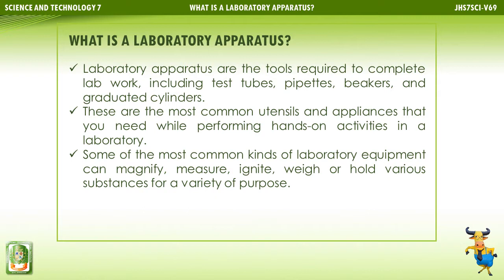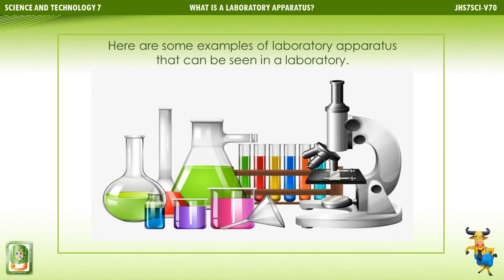Some of the most common kinds of laboratory equipment can magnify, measure, ignite, weigh or hold various substances for a variety of purposes. Here are some examples of laboratory apparatus that can be seen in a laboratory.